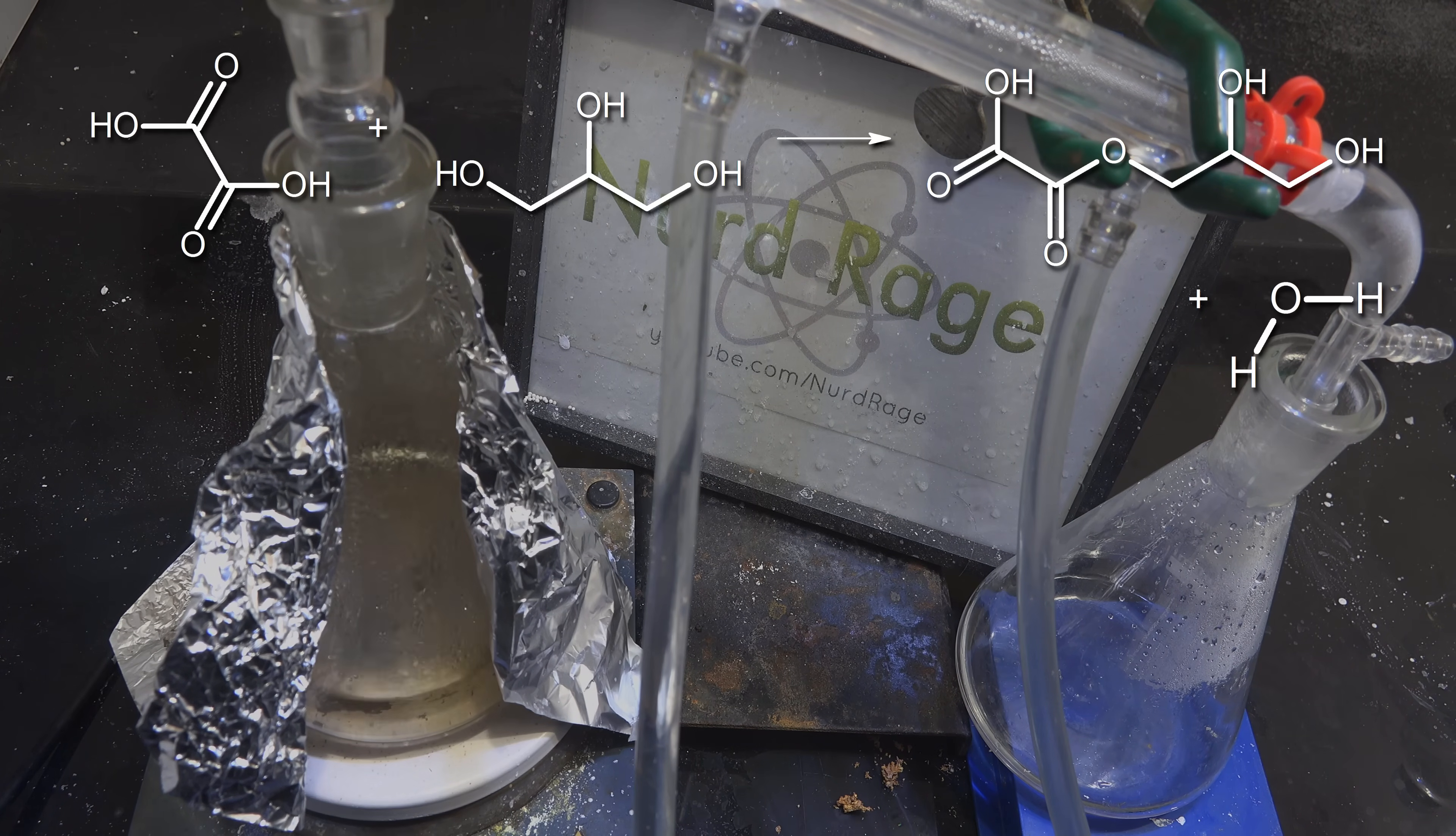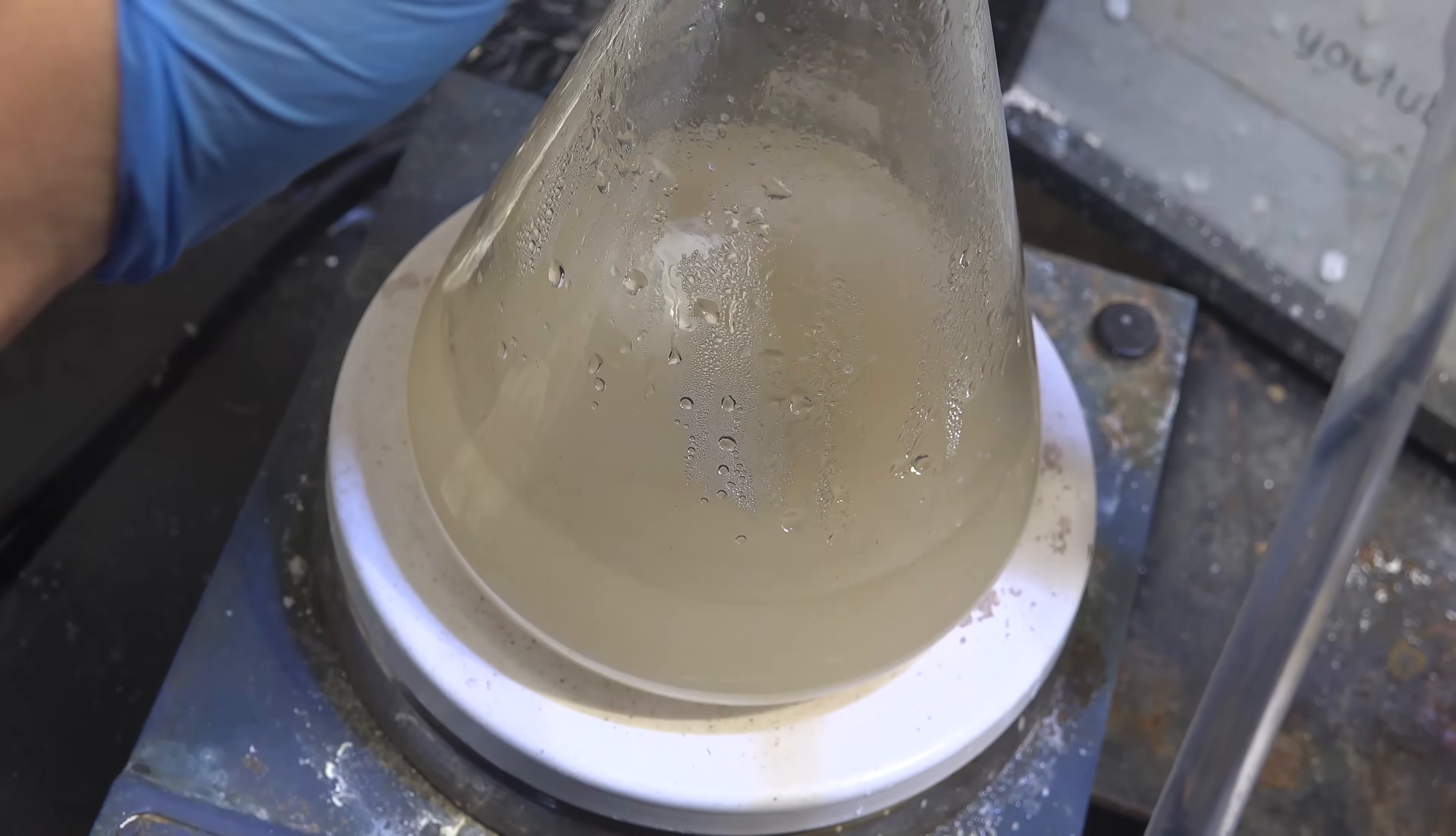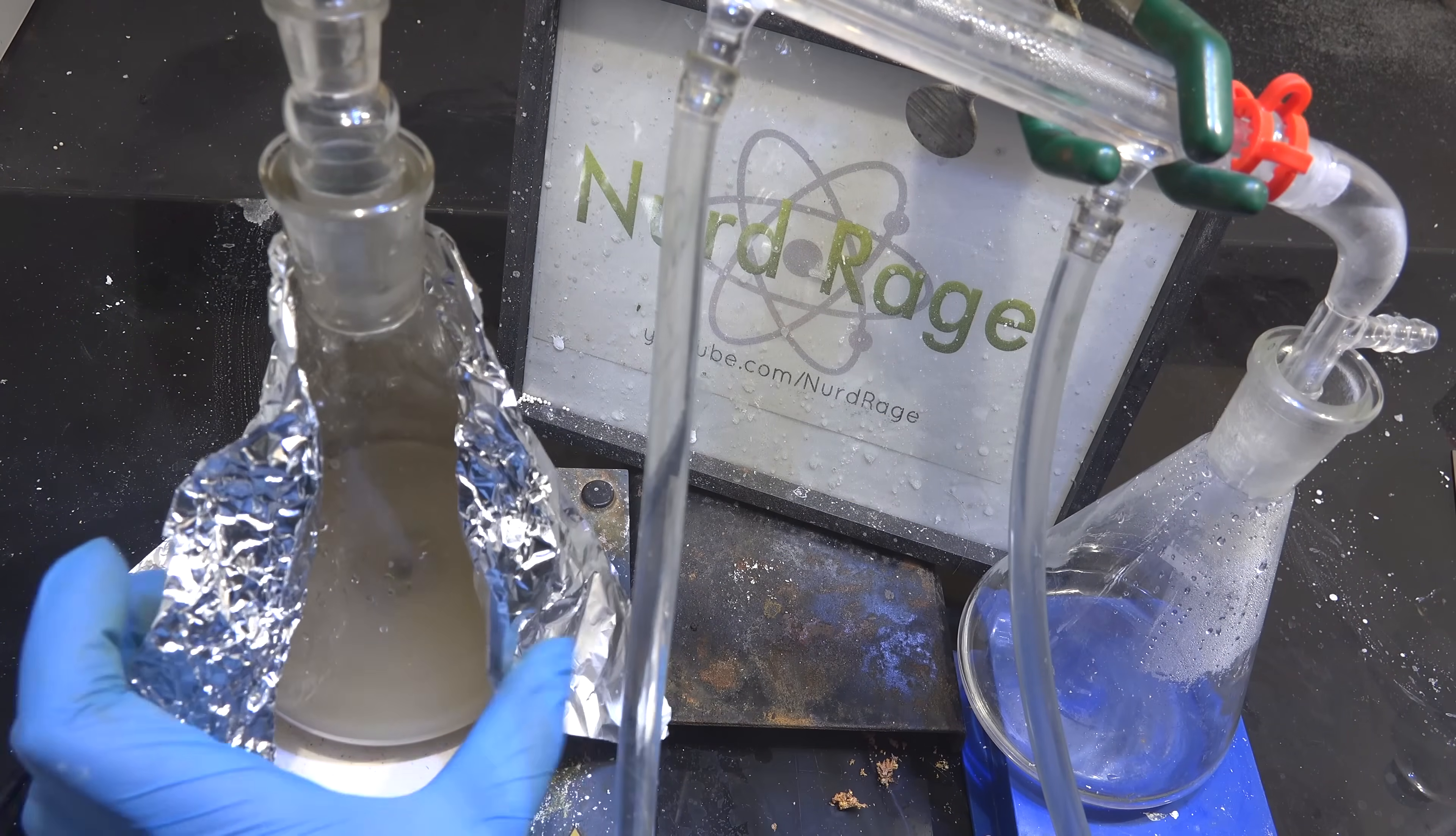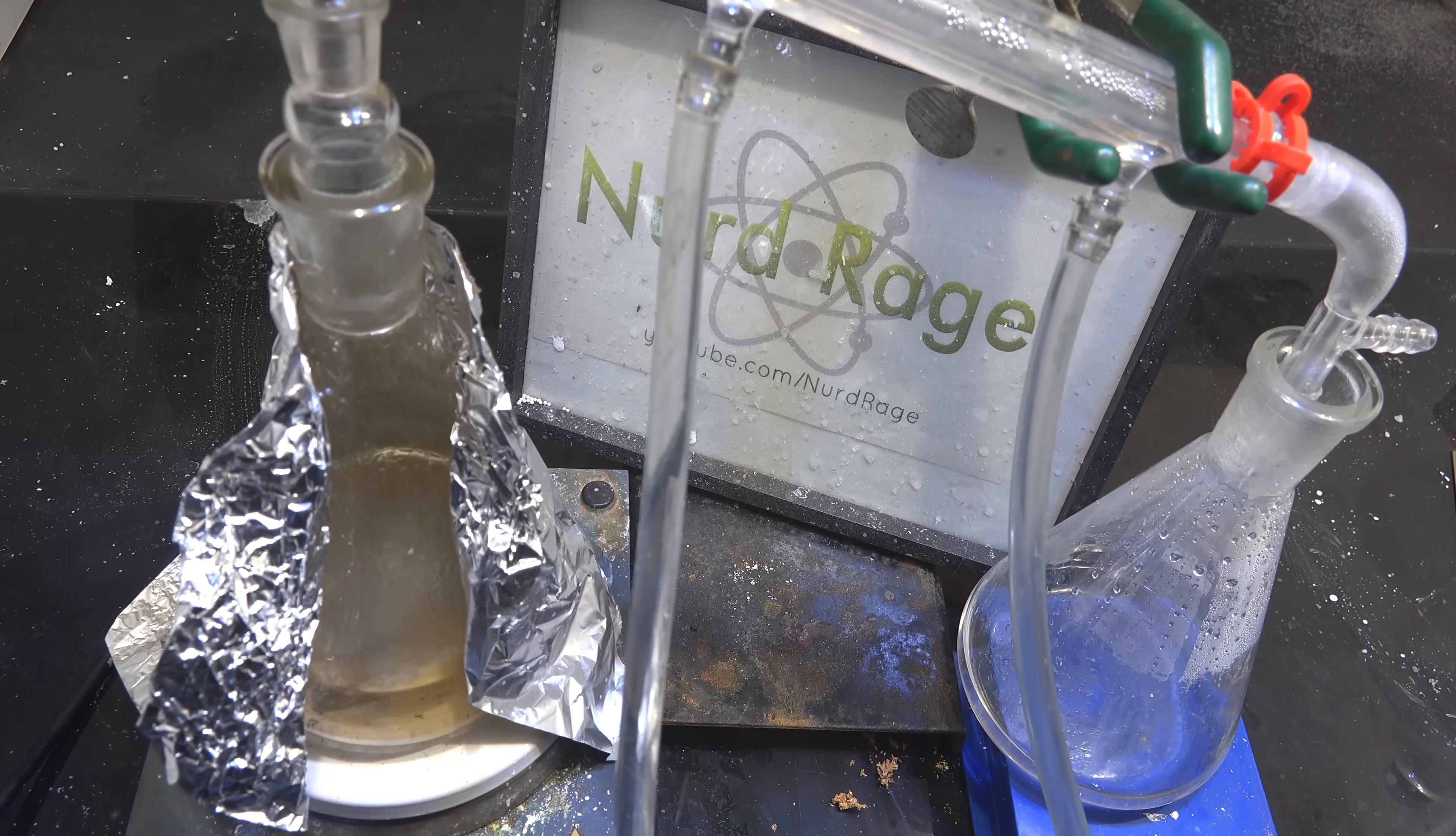The oxalic acid will go on to make more glycerol oxalate and eventually more glycerol monoformate. You can then add in more oxalic acid and repeat the cycle. We're essentially converting oxalic acid into formic acid using glycerol as our catalyst.